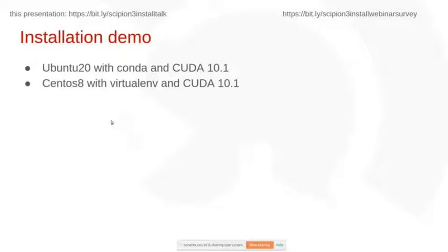Now I'm going to jump into the two demos. First, I'll demo the installation on Ubuntu 20 with conda. I prepared a virtual machine — basically the one you download from the Ubuntu website for Ubuntu 20, not the server configuration but a basic desktop installation. I already installed CUDA and conda so I'm not going to show those steps.